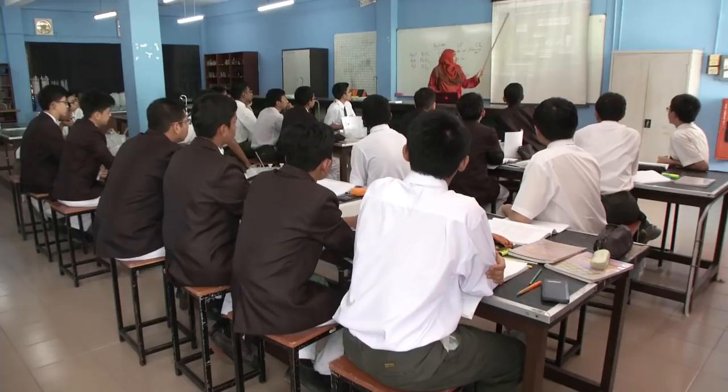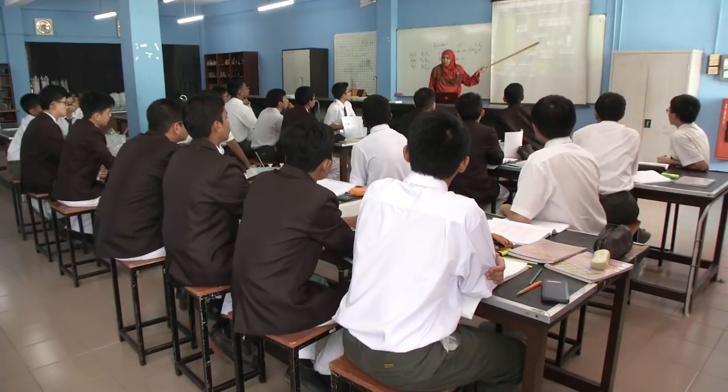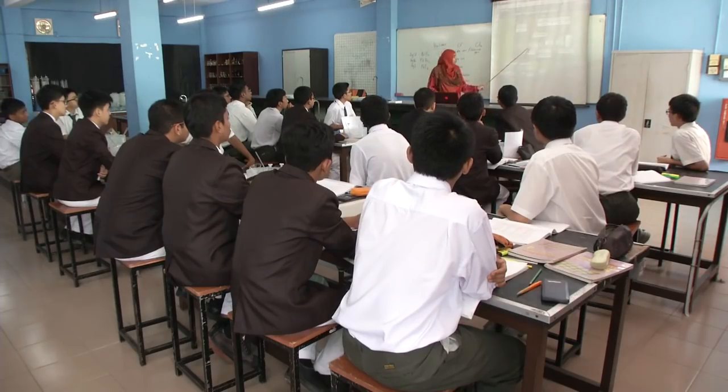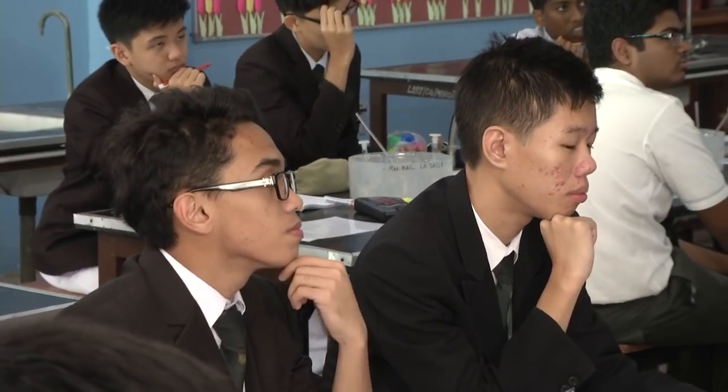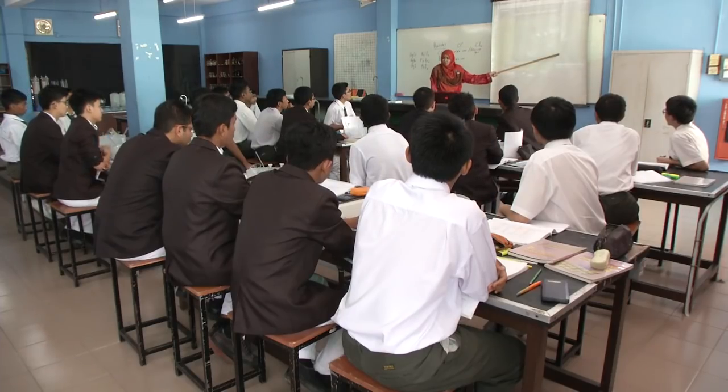We have beaker and measuring cylinder, but you do not have measuring cylinder in your list of apparatus, because the chemicals have already been prepared for you. And then how many beakers do you have in your basin? Three. Okay, one is for the formation of the insoluble salt, the other two you use for filtration. So here we have two reagent bottles. One is containing potassium iodide, the other one is containing lead II nitrate.